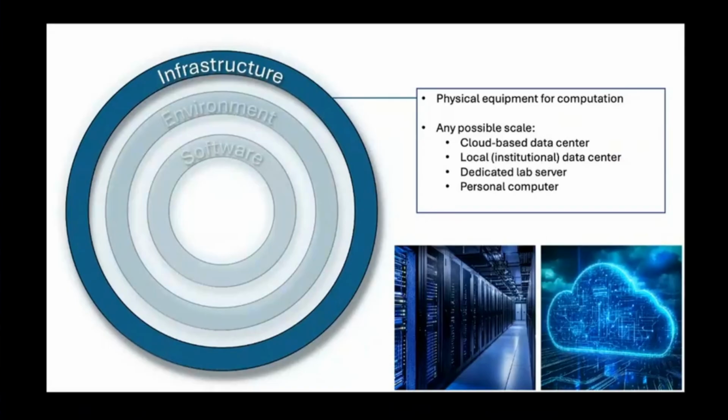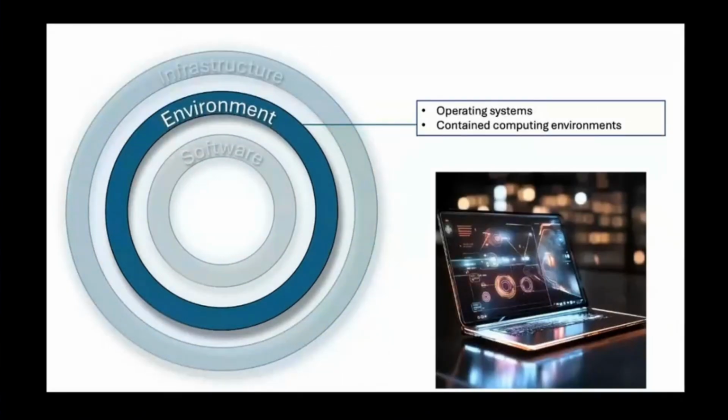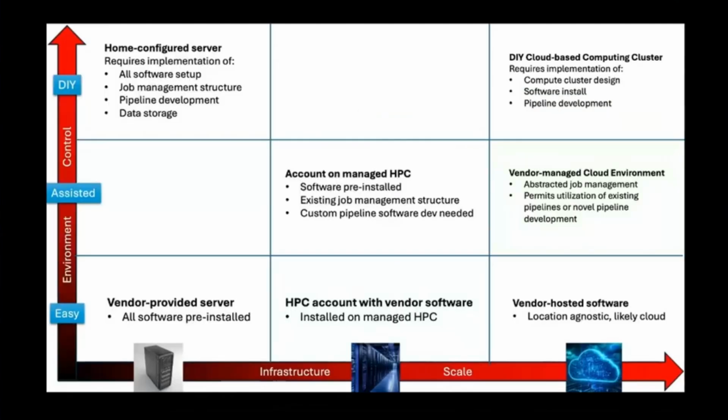The environment is more about what type of operating system or contained or managed computing environment you intend to work in. And there's really lots of options now, and they run across a wide range of infrastructure scales. And for each, we have different choices of environment that range from really easy plug and play at the bottom all the way to highly complex do-it-yourself approaches.